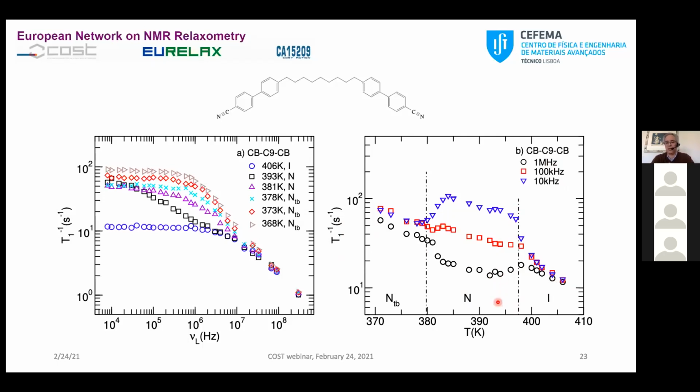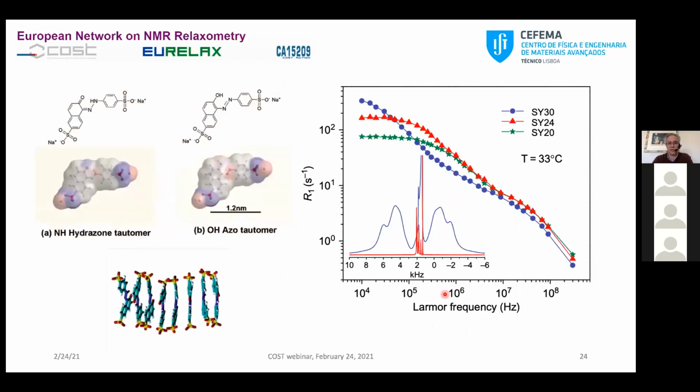So that must be correlated, obviously, with the structure, with the level and the type of molecular organization. That was obvious from the start and is still obvious today whenever we have new data. The same thing happens for all the systems that you will see here, and probably if you do NMR, NMRD, NMR relaxometry, you will find out that your points will also fall within this window. So the important thing is how can we look at this data and extract information which might be relevant to characterize the system and to know more about them.